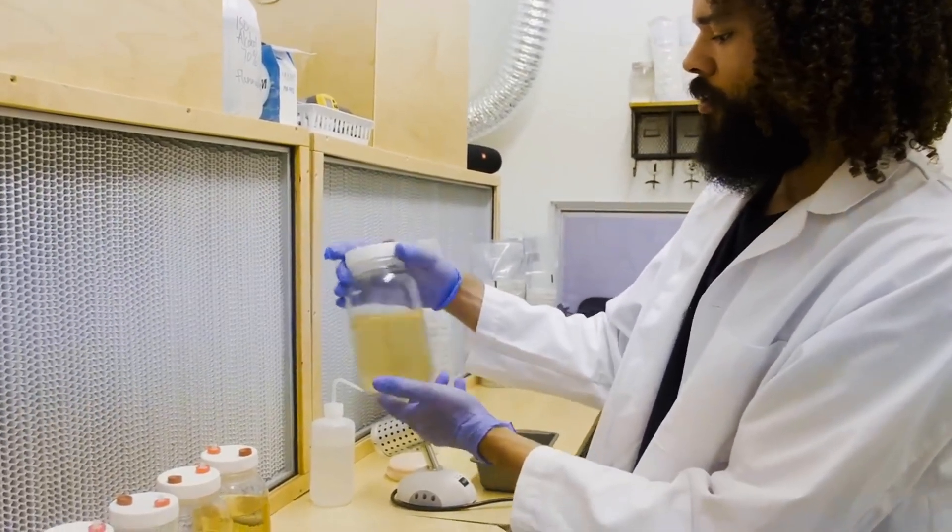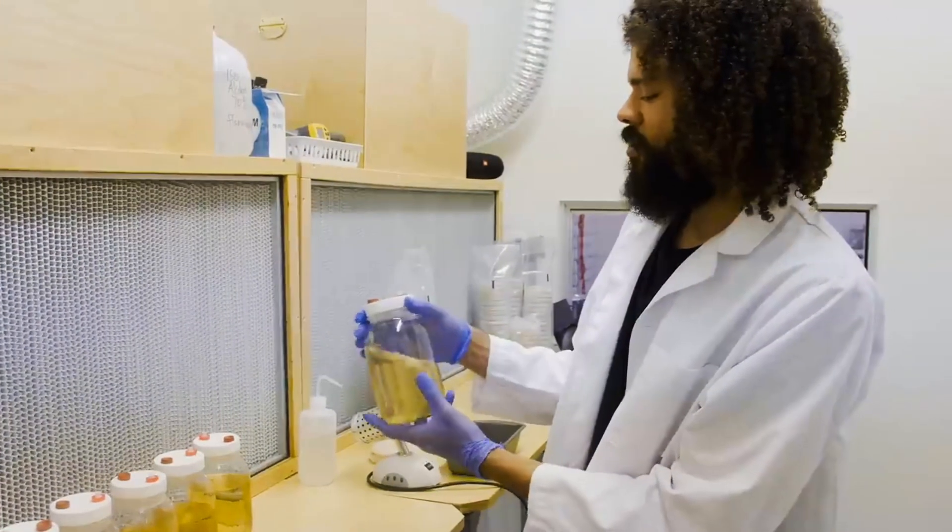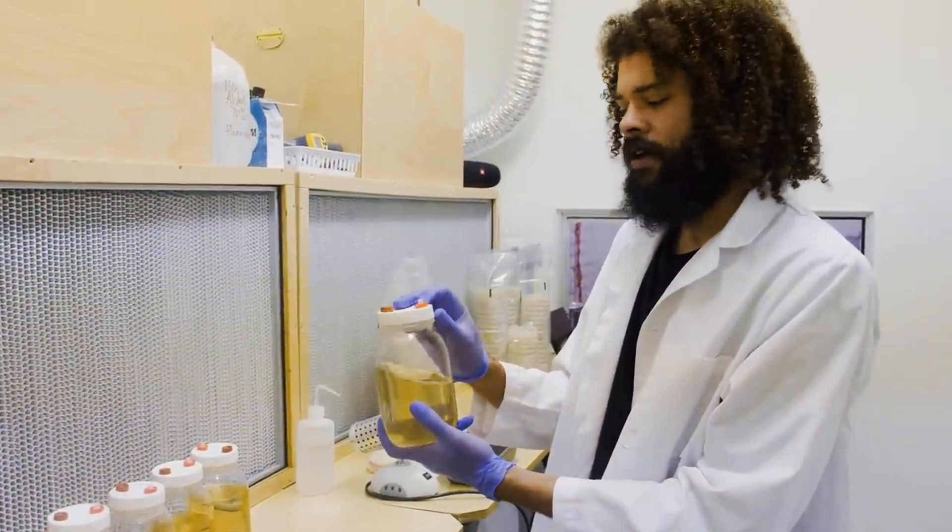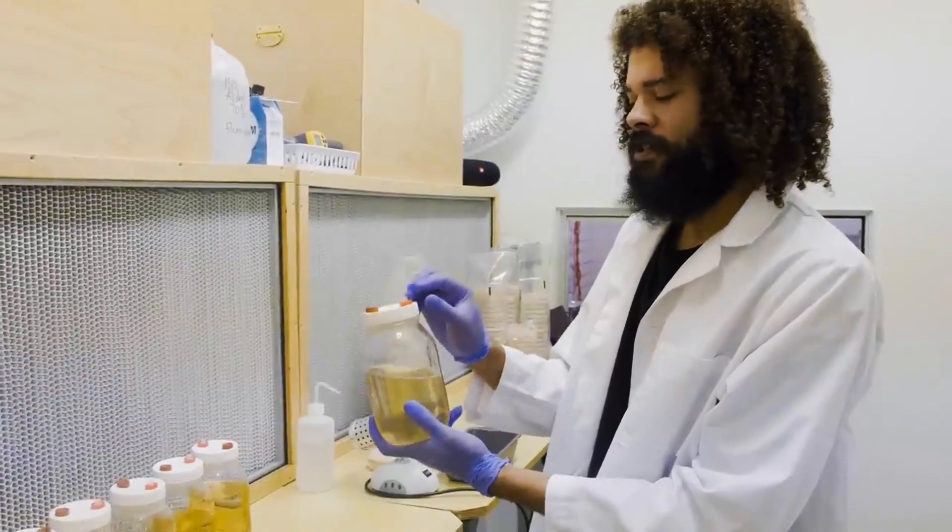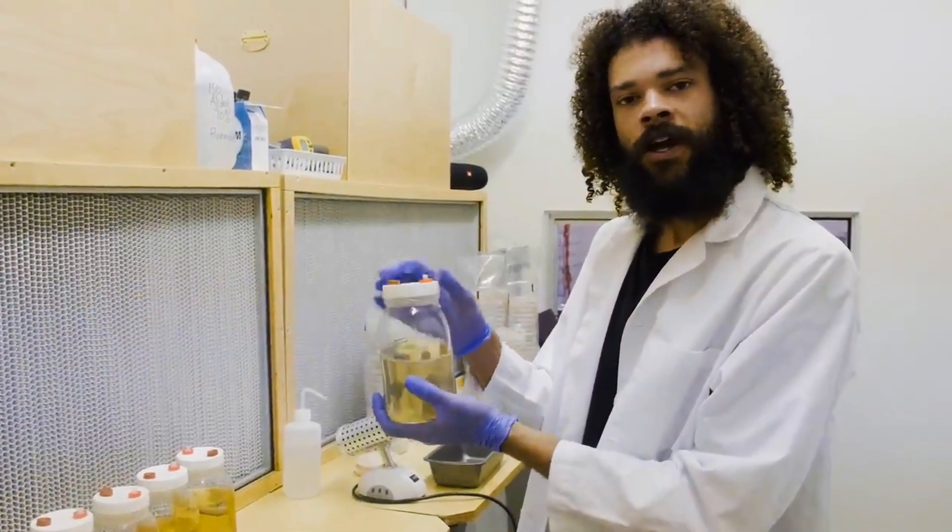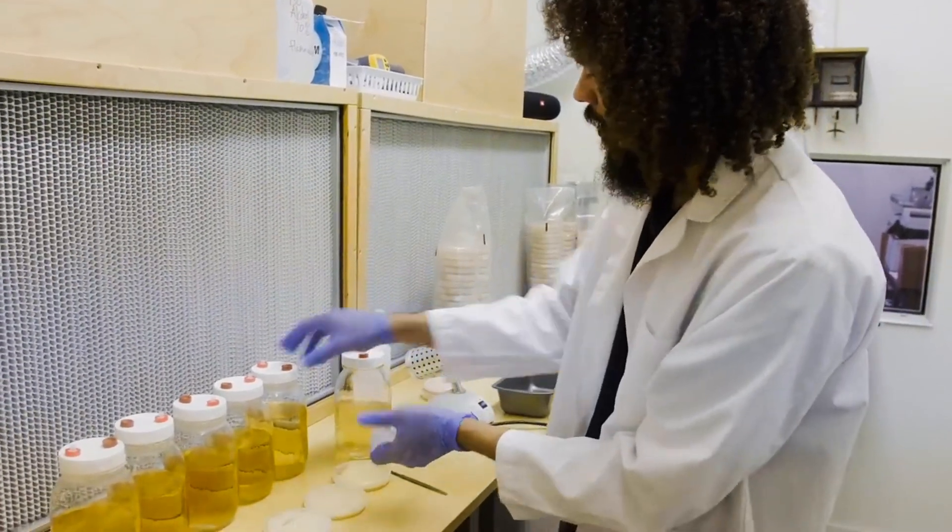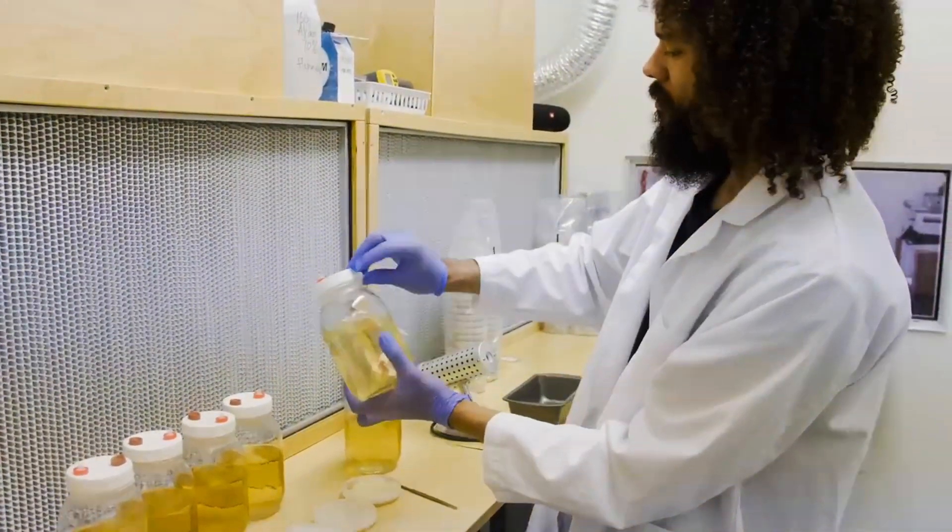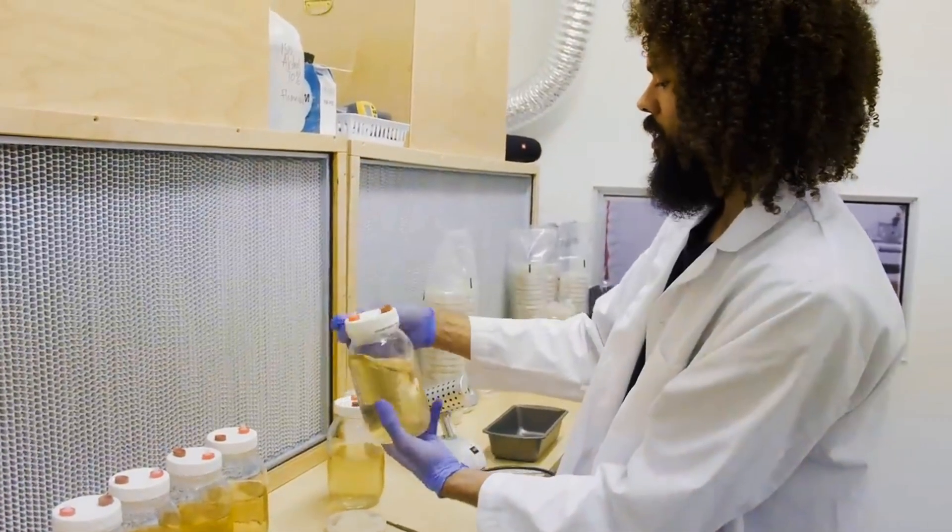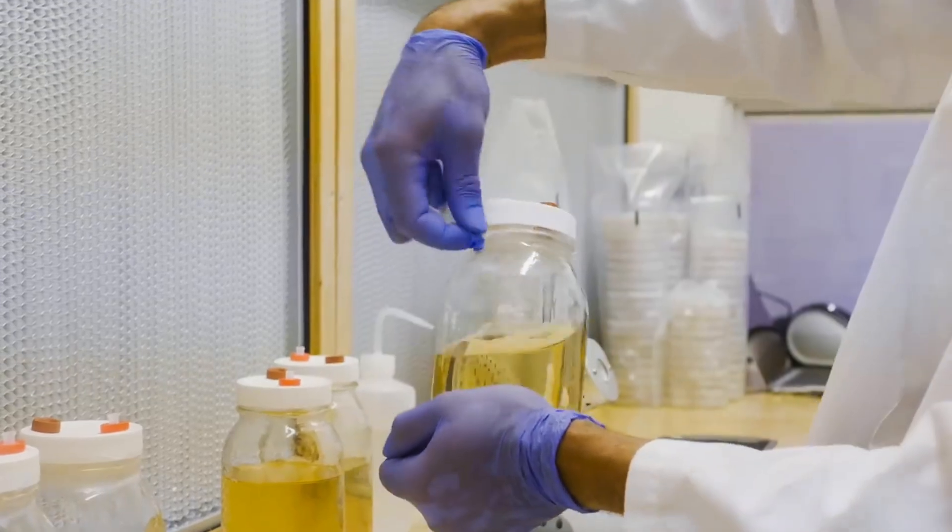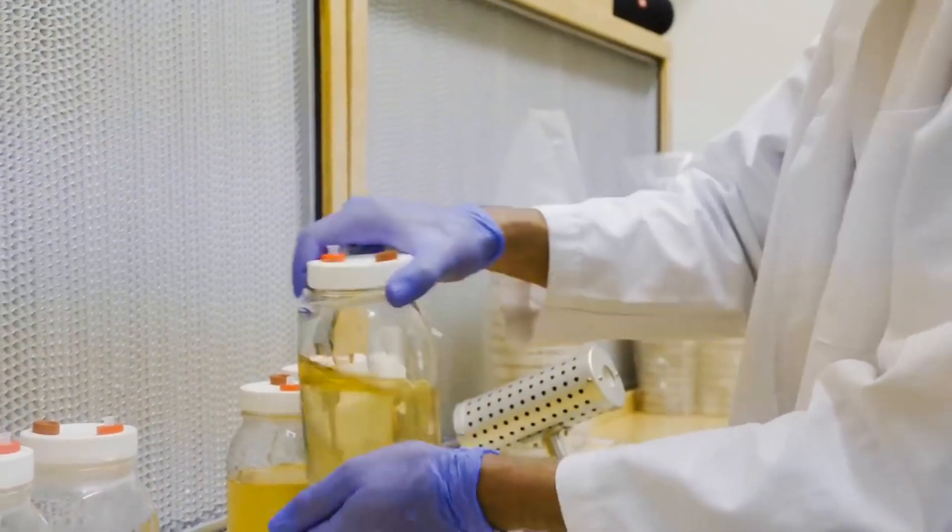About six to eight hundred milliliters of water. These lids are equipped with a self-healing injection port and a syringe filter to give the liquid culture adequate gas exchange as the mycelium grows throughout the liquid. I wrap my jars in parafilm to make sure they're clean when I don't have my flow hoods running. Sometimes it can be a pain to pull off.